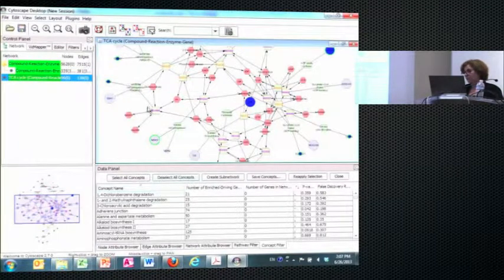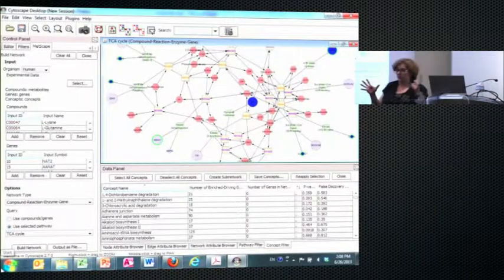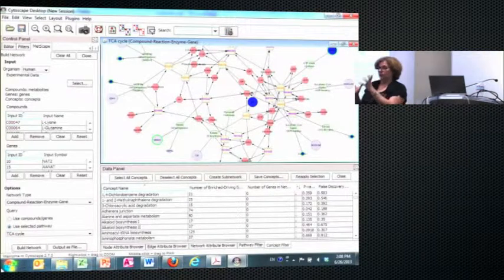So here it's still selecting only the compounds that were in the experimental data? Nope. That's what it did differently, and that's why I wanted to show it. What happened was, instead of telling it to use the input genes or compounds, it is now using the set of genes and compounds in a pathway that I selected. But it still keeps in memory the data set that we loaded. It's just selecting what will be displayed in a given network. And that is determined by this pathway drop-down now.